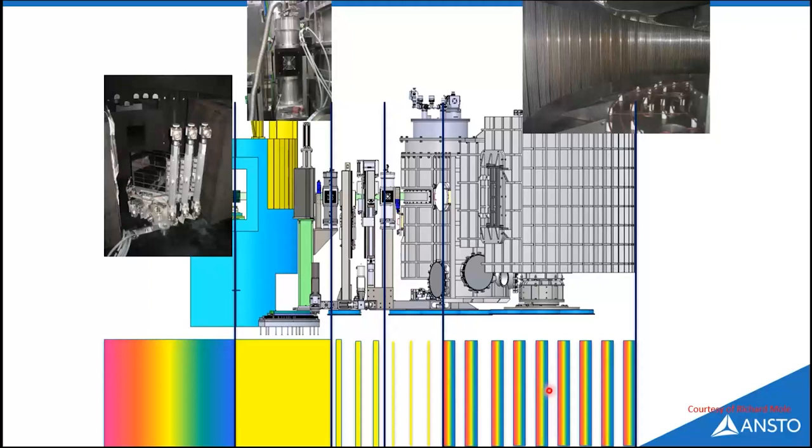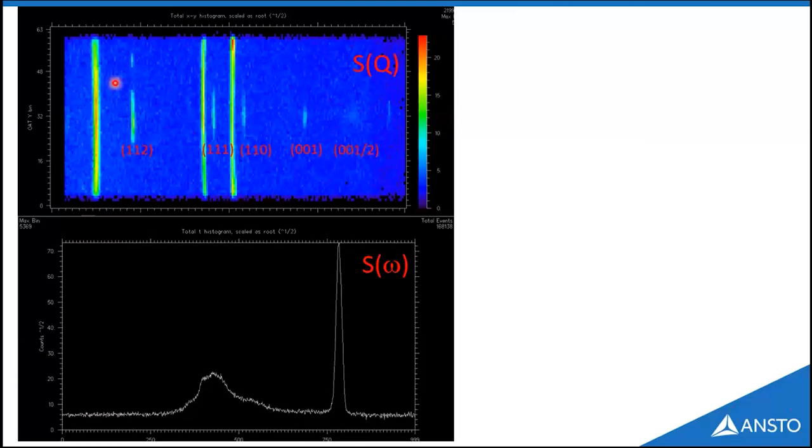So from the detector, we can see this. On top of this, we see basically the S(Q). This is like a diffraction pattern. For example, this is a single crystal, and you can see all these different Bragg reflections when we rotate the sample, and at a certain detector we see these Bragg peaks. And this long line is the powder line. We also call it, from the polycrystal or a powder sample, where we will see this kind of Bragg reflection form a line.